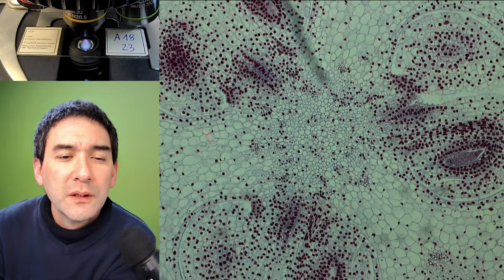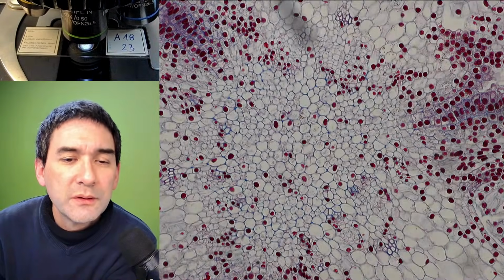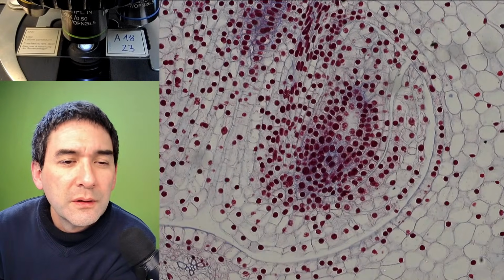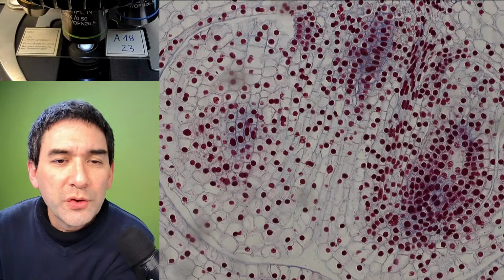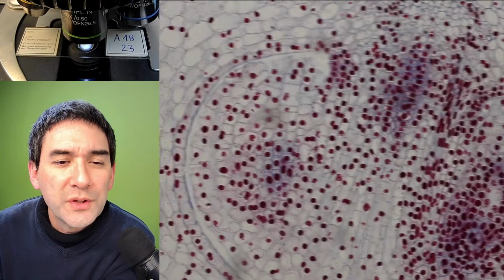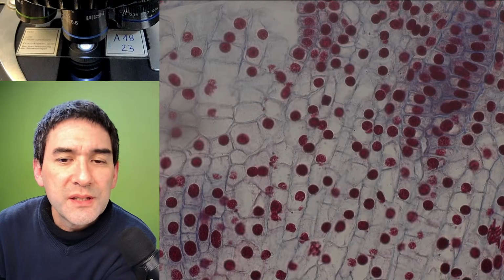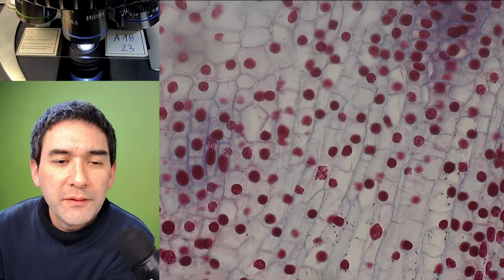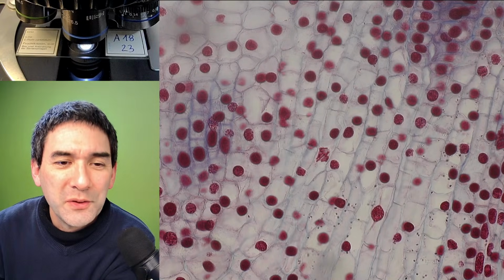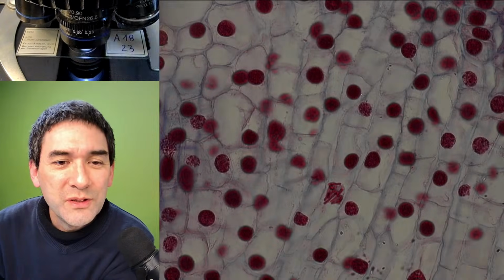Let's go up yet a little bit more with the magnification. Let's use bright field. I forgot where it is. Each one of those round circles is of course a nucleus. It was stained with a substance that stains DNA, and here we already have the thing. I already know the specimen, of course. And maybe you already noticed something in the center here.